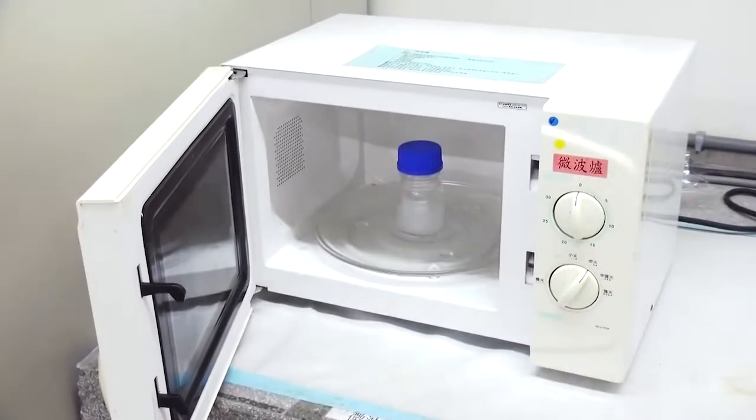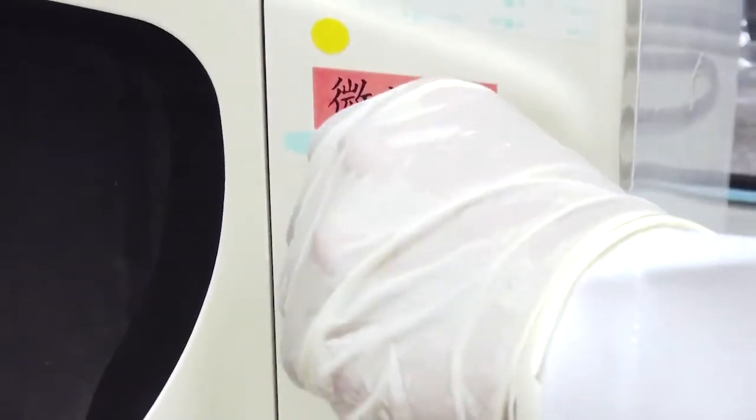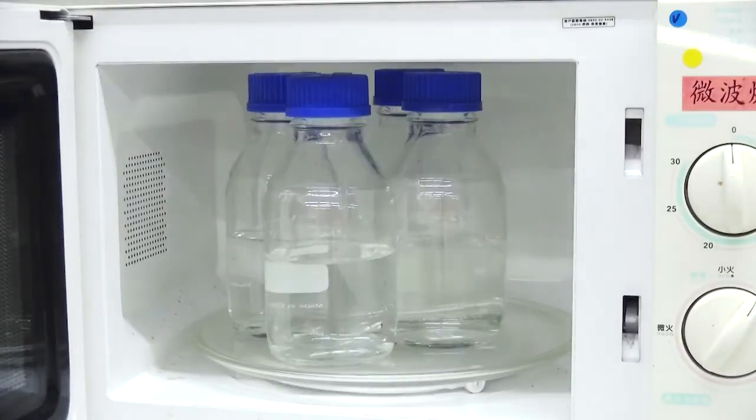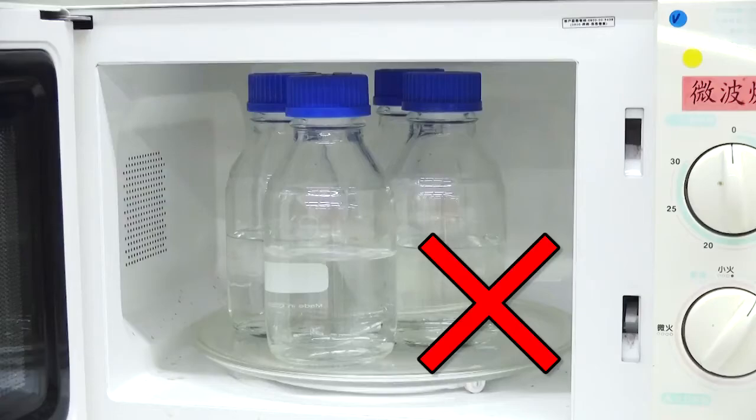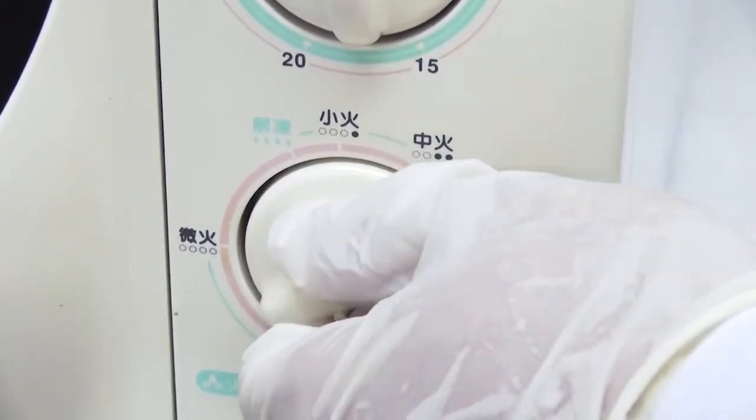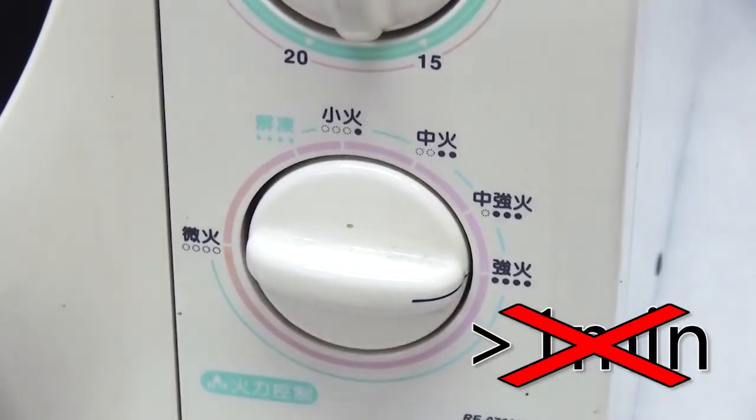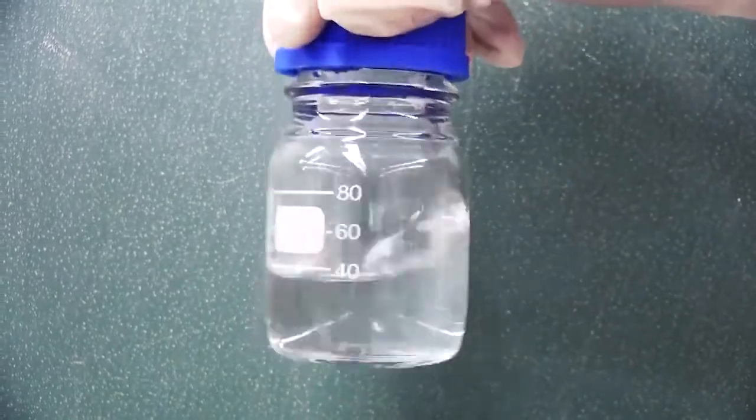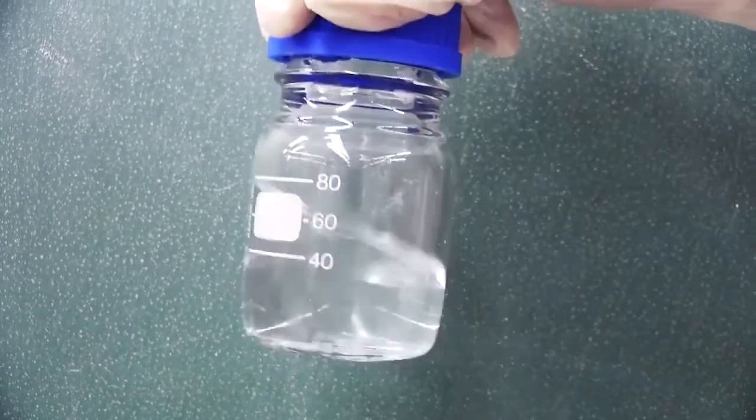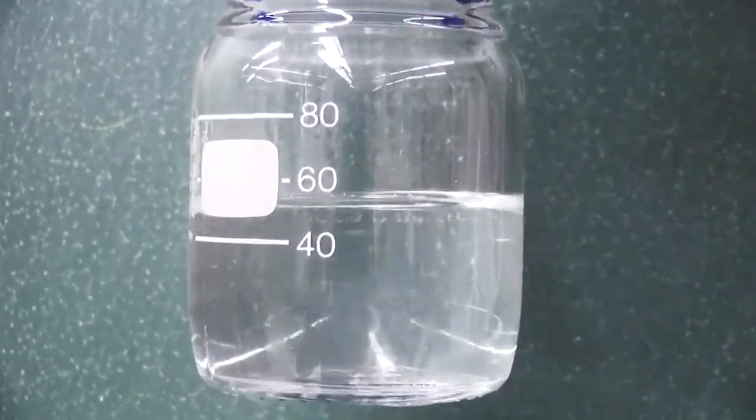Heat the solution in the microwave. Do not microwave more than one bottle at a time to avoid uneven heating. Do not microwave the solution in increments longer than one minute at the highest power setting to avoid overheating. Check if the solution becomes completely clear after microwaving. If not, microwave until the solution is completely clear.